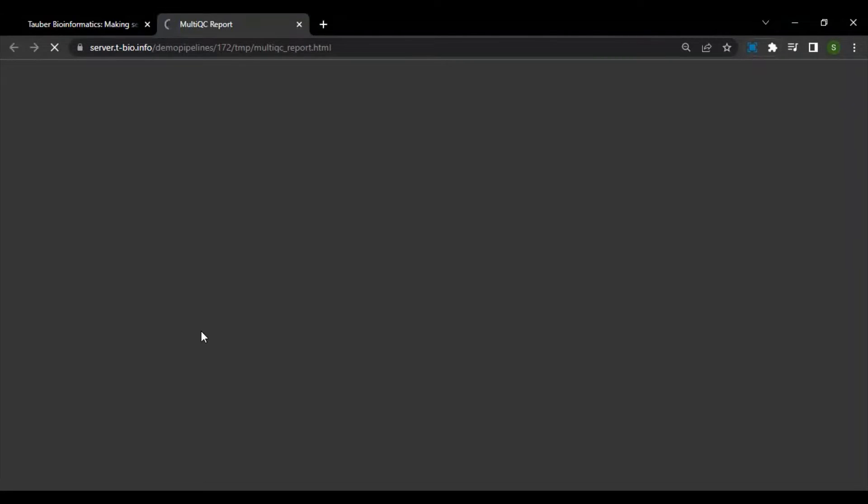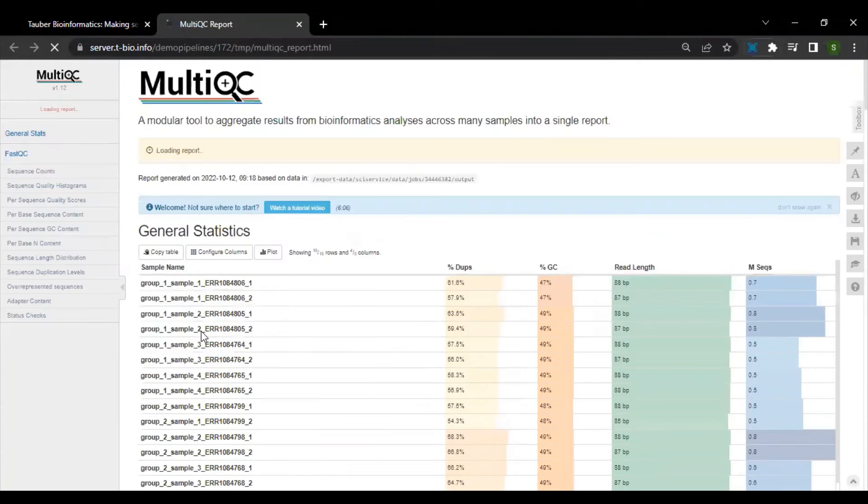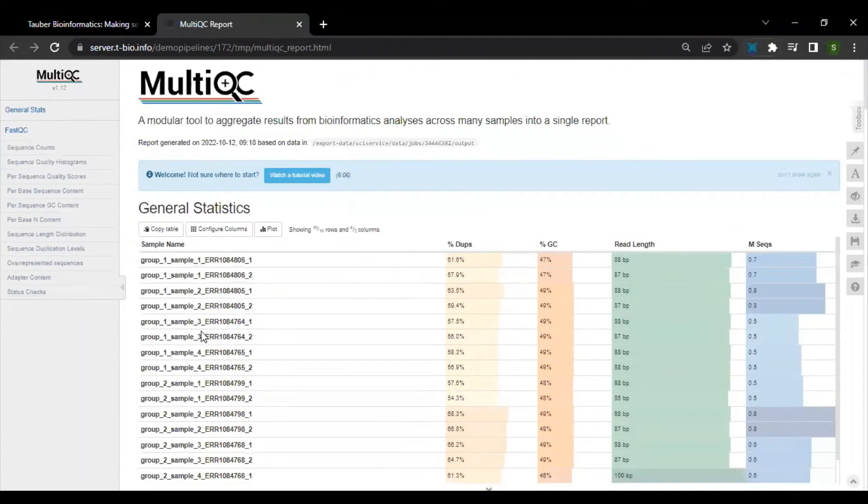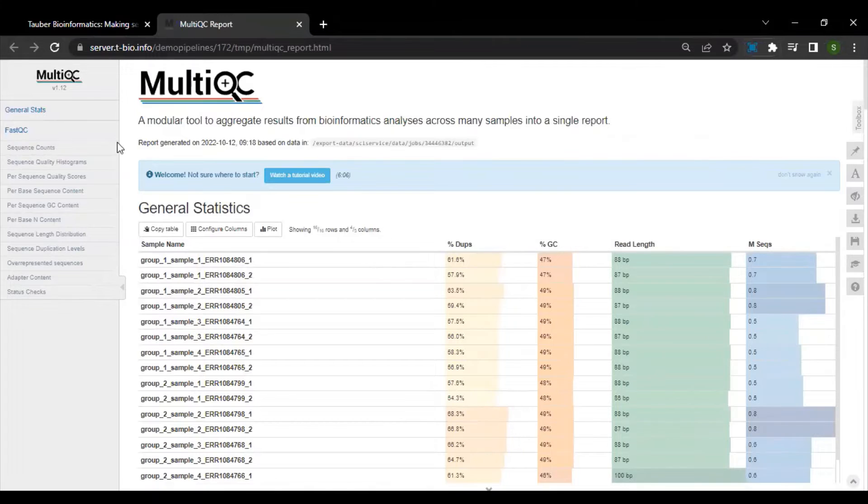To see if our reads are of good quality, we can take a look at the MultiQC report online for quality assurance.